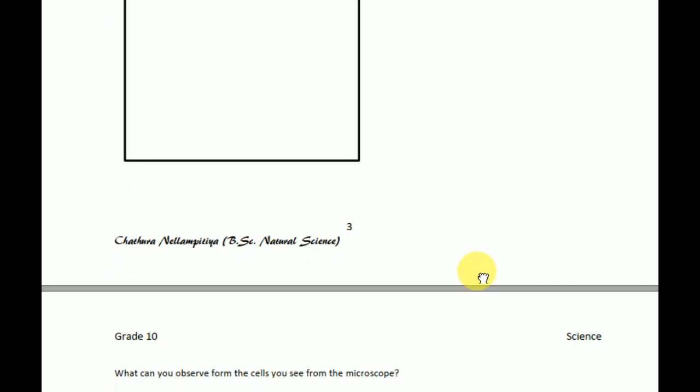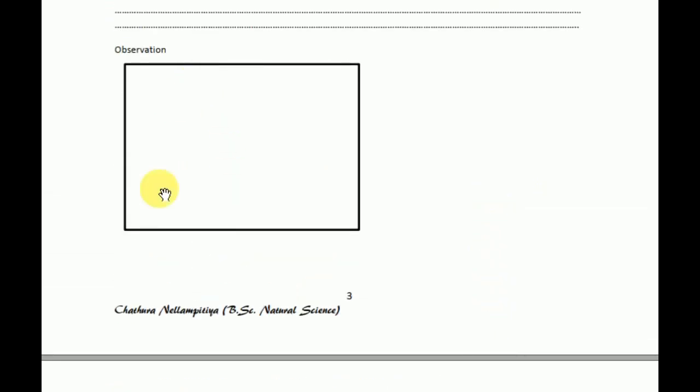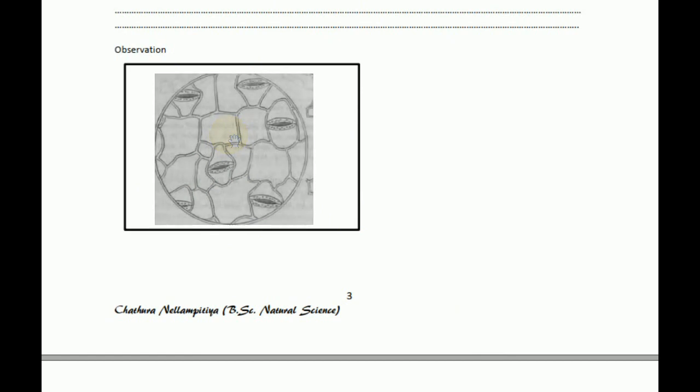What you can observe is a very important thing: these cells have a proper arrangement and a proper shape, polygonal shape, and the cells have a thick boundary. We will think about what that boundary is. The other thing is that these cells have firm attachments, and there are no gaps between the cells. The cells also have a central part, a sac-like part. We will learn in the future that it is called the vacuole. So you can observe these structures from the light microscope under mid power.